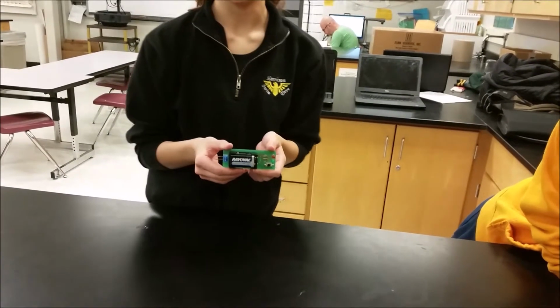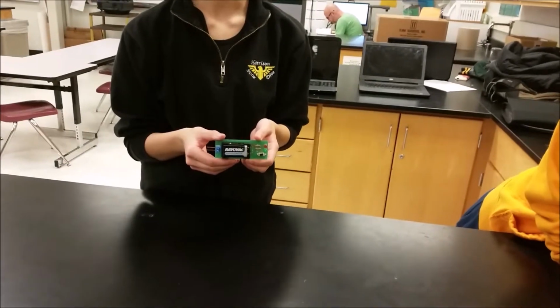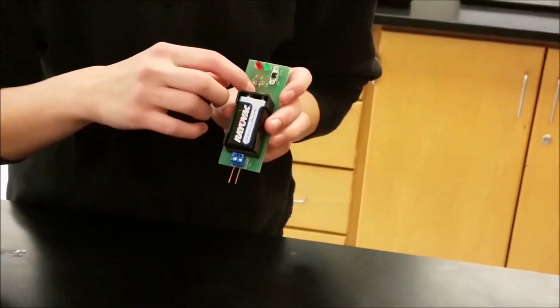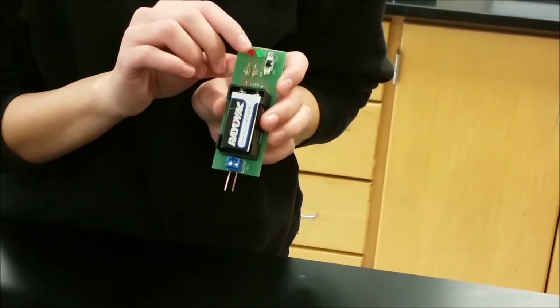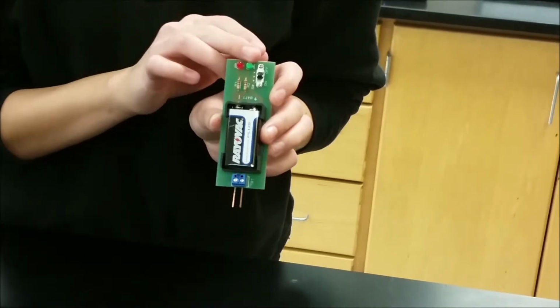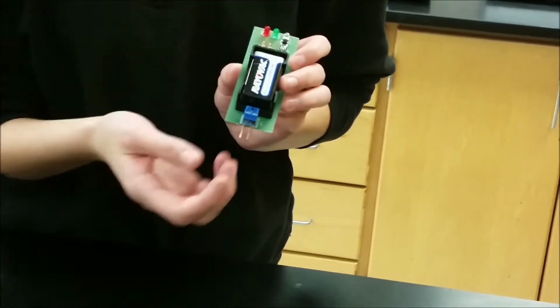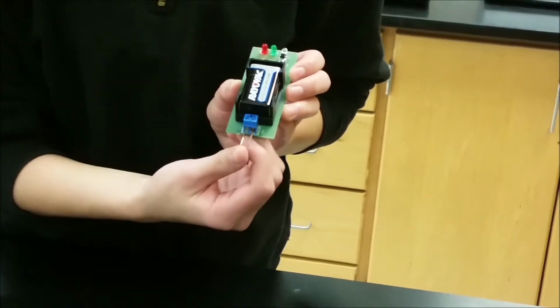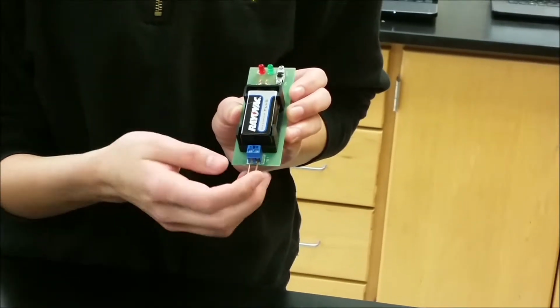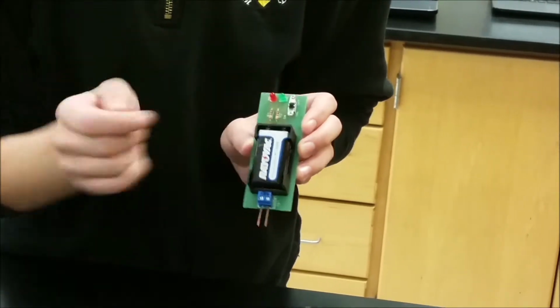This is the conductivity meter, and with it we're going to measure the conductivity of our acidic or basic solutions. So from the battery, electricity will flow through this resistor into this light, and this light bulb will have more voltage. Then because it's in series, this light bulb will have less voltage, and the more conductive the solution in between these two parts of the circuit is, the more voltage will flow into the two light bulbs.